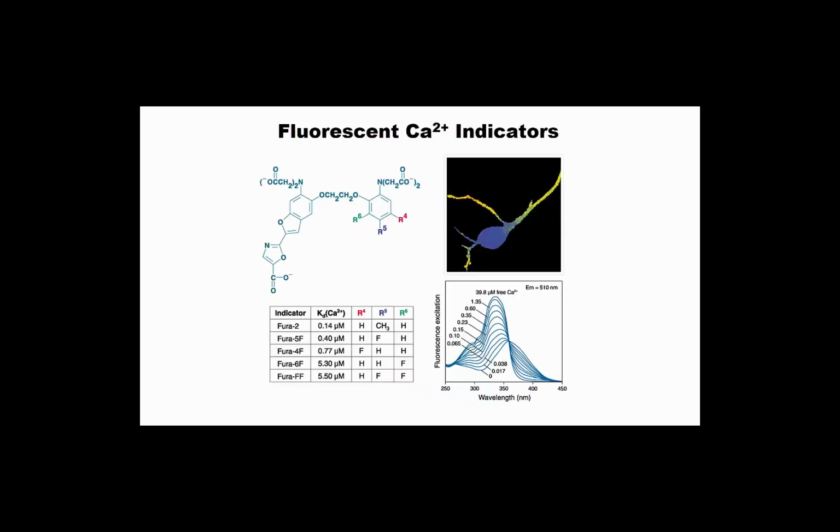Not only those structural stainings, but now also functional molecules can be selectively stained. Calcium is a very important second messenger inside the cell. That's why measurement of its changes in terms of time and space is quite an important question.